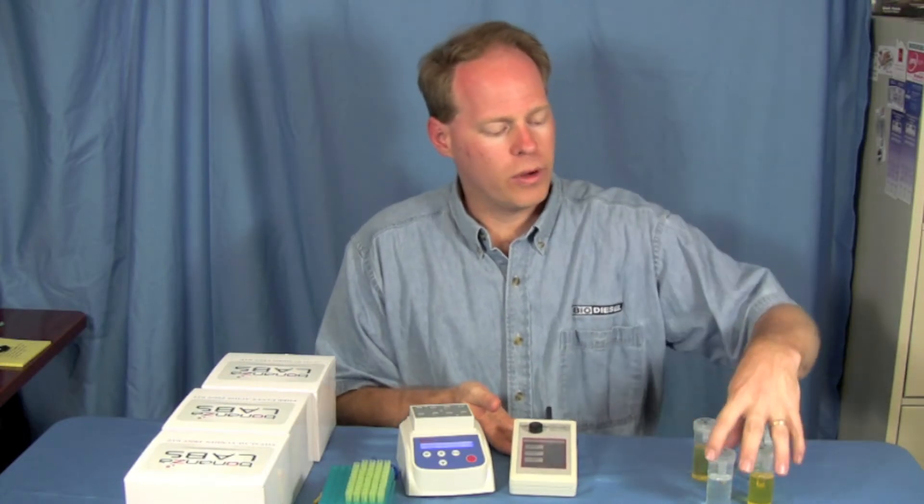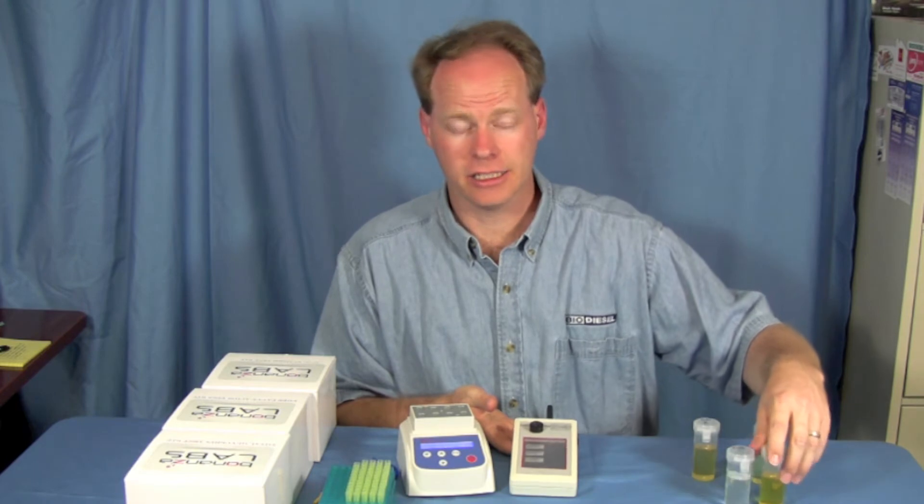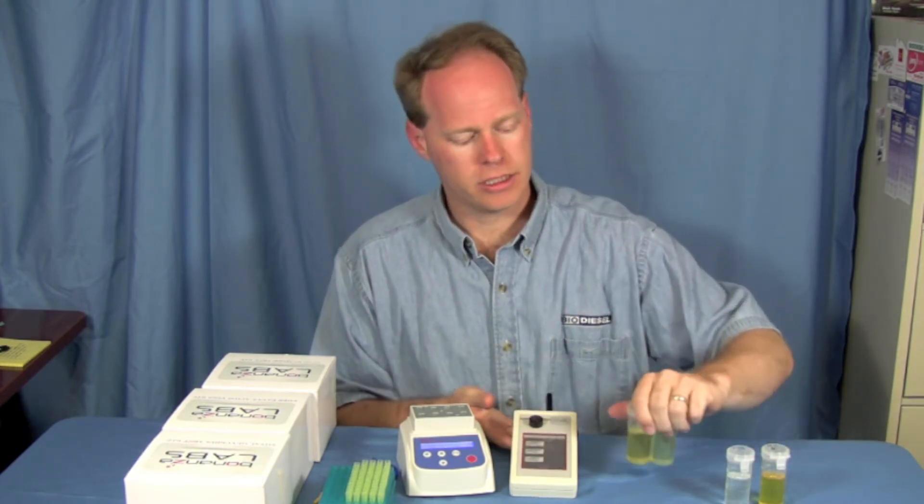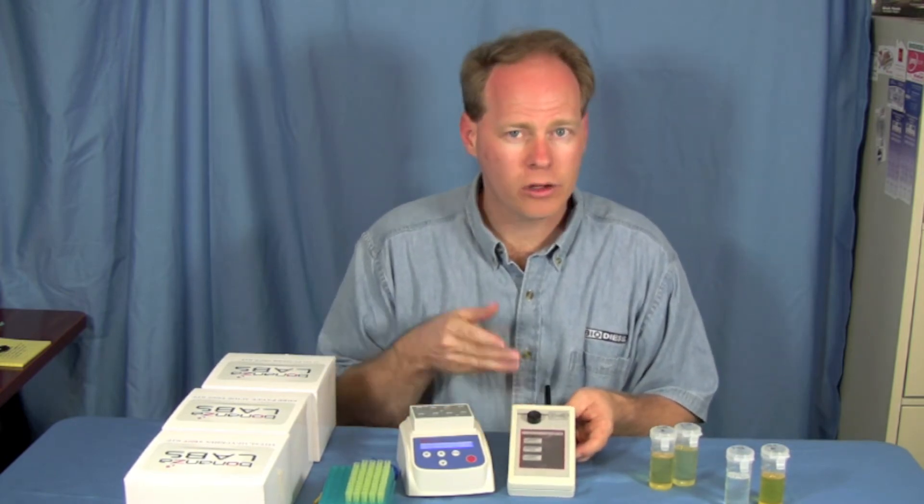Not only can you test oils to see what the free fatty acid levels are to figure out how much catalyst you're going to need, but you can also test your biodiesel. Using this machine, you can find out how accurately you have made fuel, how good the conversion is with the total glycerin test.